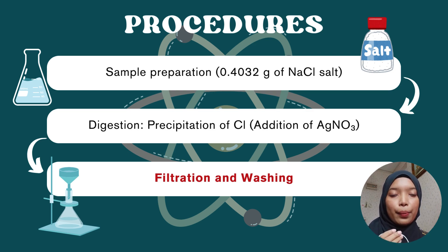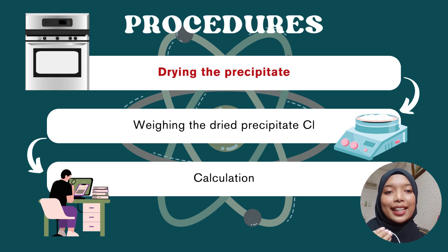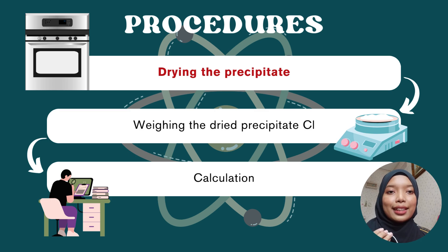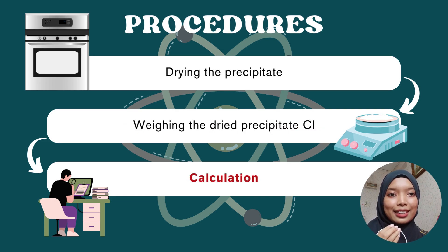The precipitate was also washed with 3 portions of 5 ml acetone to ensure its purity. After sample preparation, digestion, filtration, and washing, the wet precipitate in the filter paper is brought to a 110 degrees Celsius oven for drying. After 30 minutes in the oven, the solidified precipitate is allowed to cool for 5 minutes, then weighed with an analytical balance.